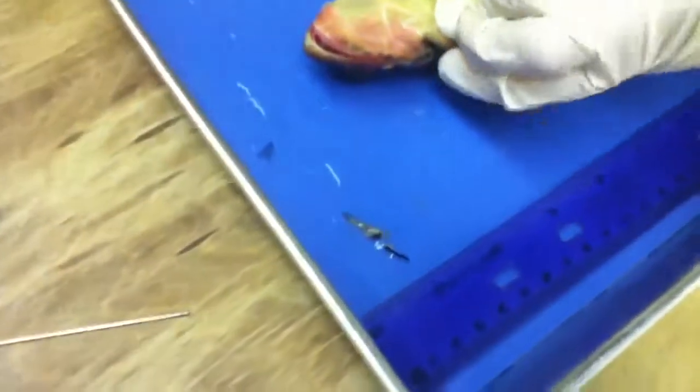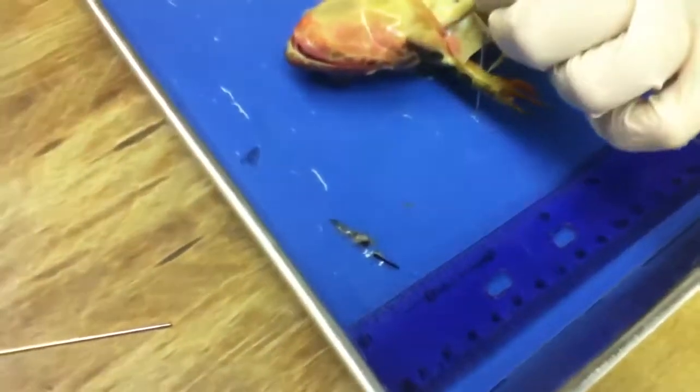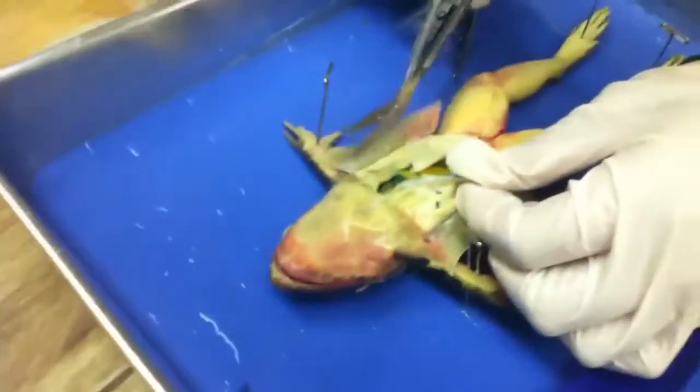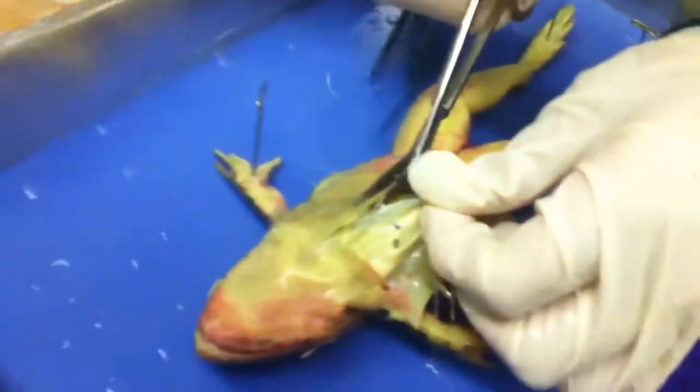Tell me when you're done cutting it so I can read the next instruction. You need to pin the skin down. I know, I have to cut it before I can pin it down. I think you cut some organs. I only cut the fat bodies. It's okay.